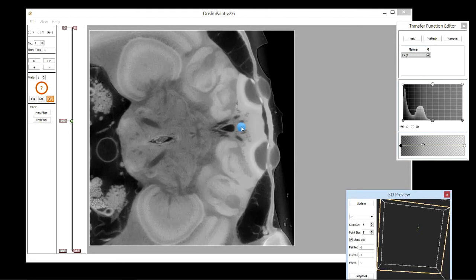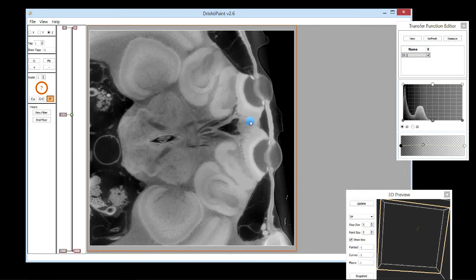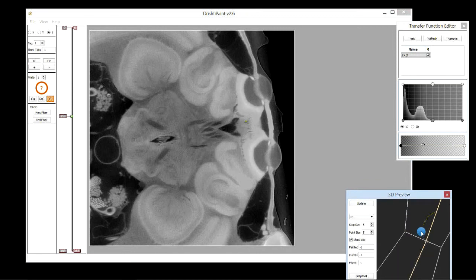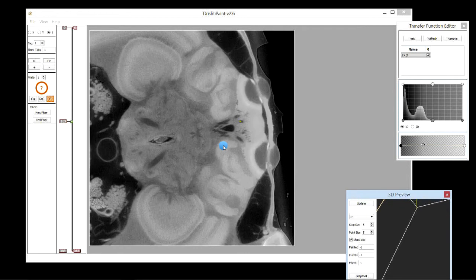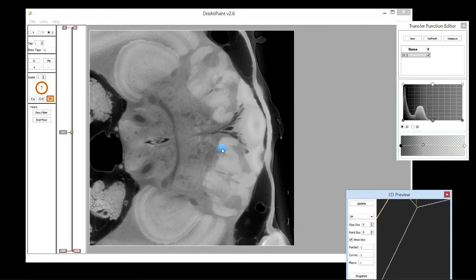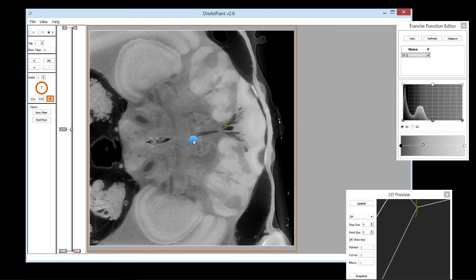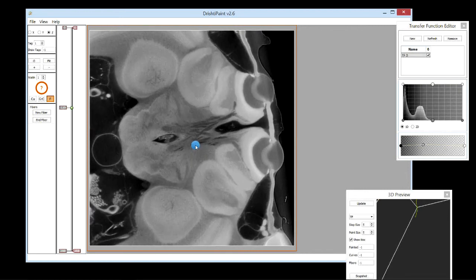And then here, possibly here. So this is the track here, and we can give the thickness to that track. And then it possibly merges. These points can be changed later on as well. So let's track a bigger one. So let's try this one here.